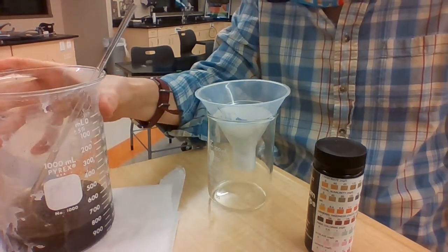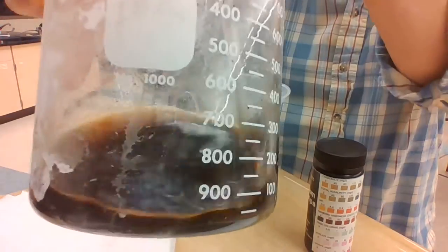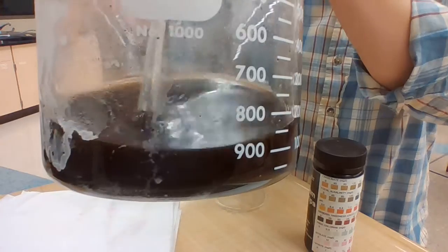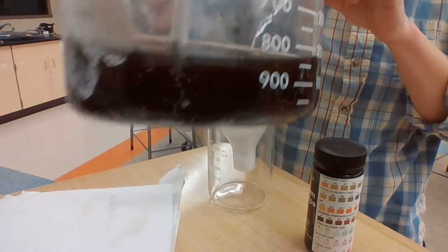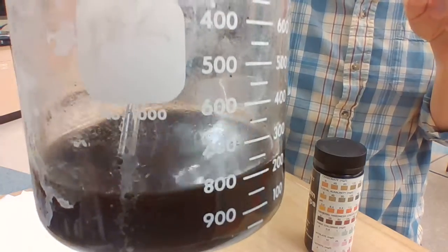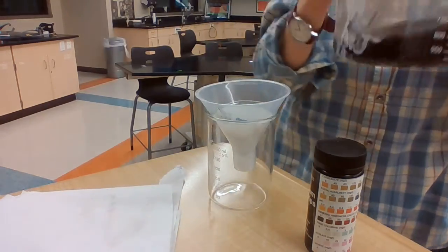All right, so here I have some really nasty water that I mixed up for this lab. In your table, you're going to have to describe that: color, and not see-through, right? Like super gross. I'm going to go ahead and pour some.